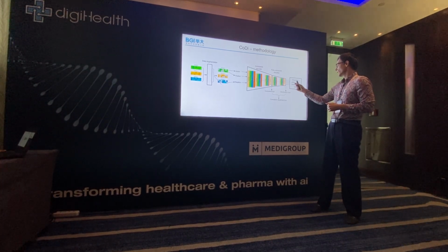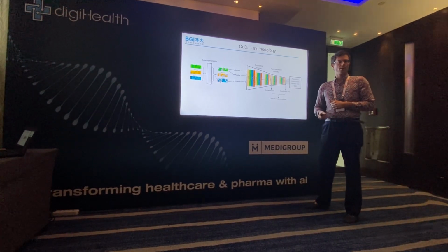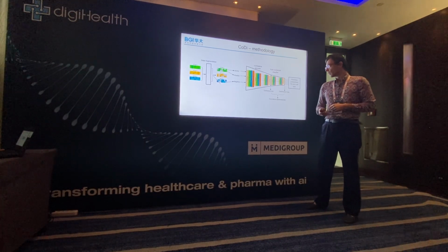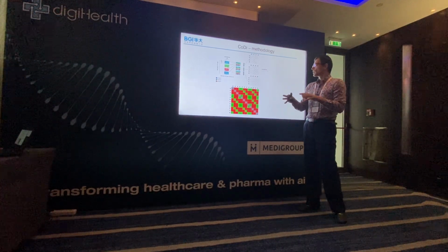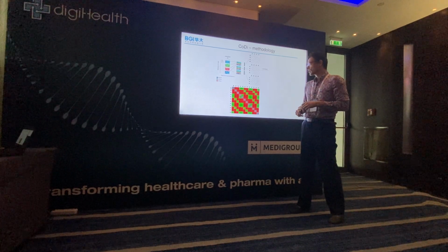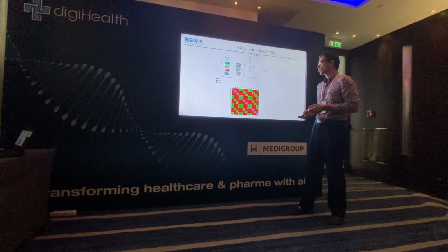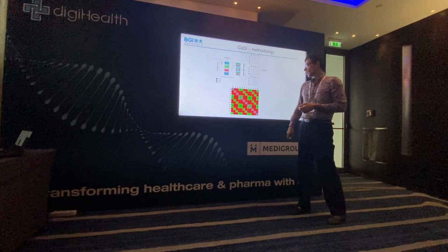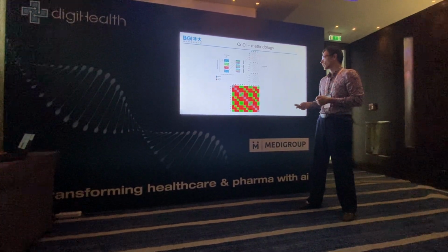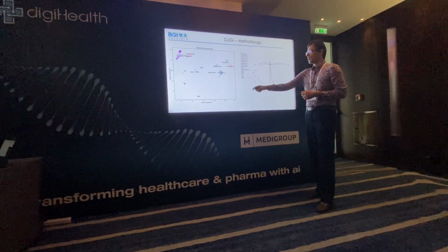And as an output, we have prediction and probabilities for each cell type, which we can use to construct this confidence map that I showed you. This is just some closer insight into how it looks inside of the batch. Since we cannot put all the samples on the GPU at the same time, we divided it into batches, and inside of every batch we mark which cell types are the same and which are different from the current one, and we can obtain this supervised loss. This would be the result.